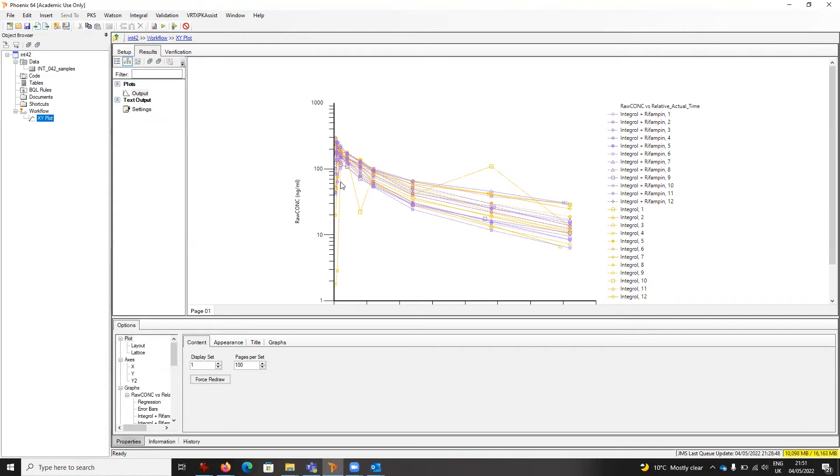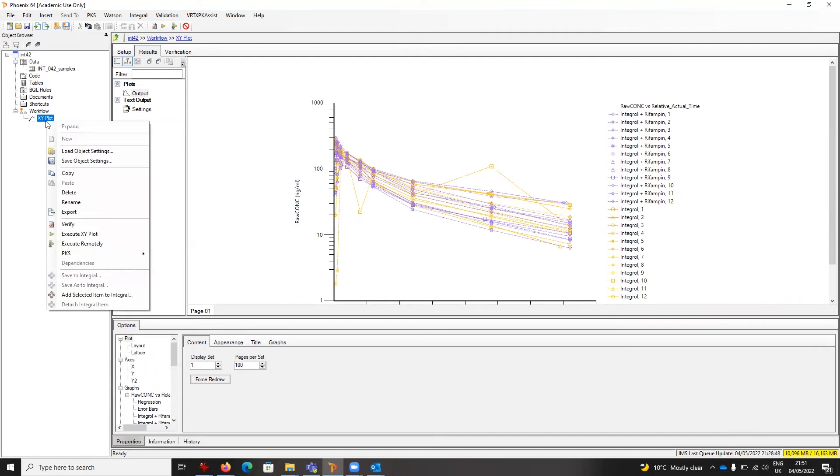If these sort of definitions for a plot or any other object setting are ones you want to have applied every time from the beginning, you can actually make those a default. Let me show you how to save an object setting.